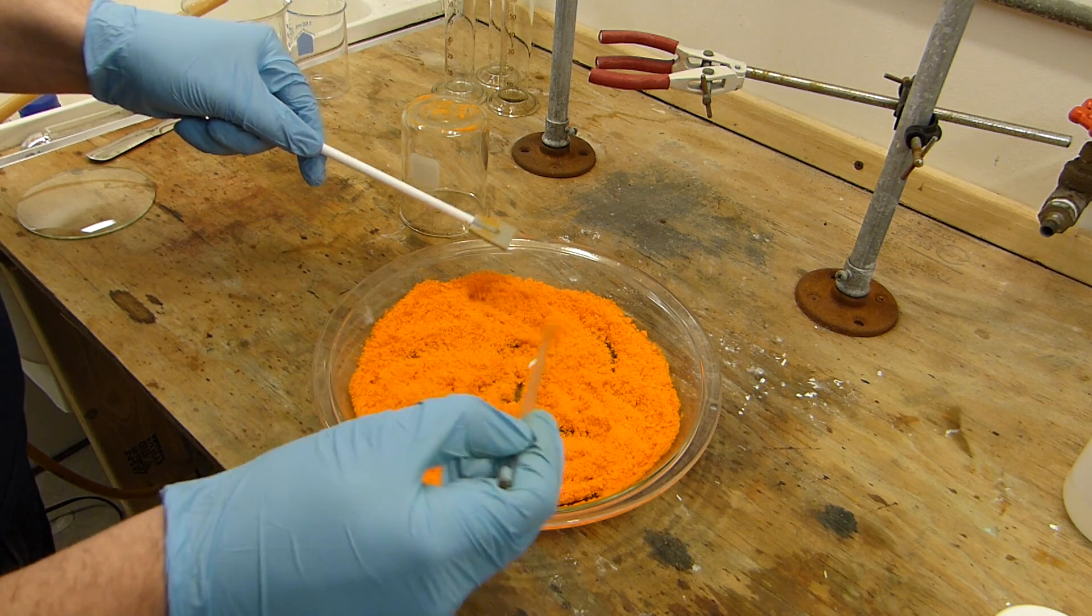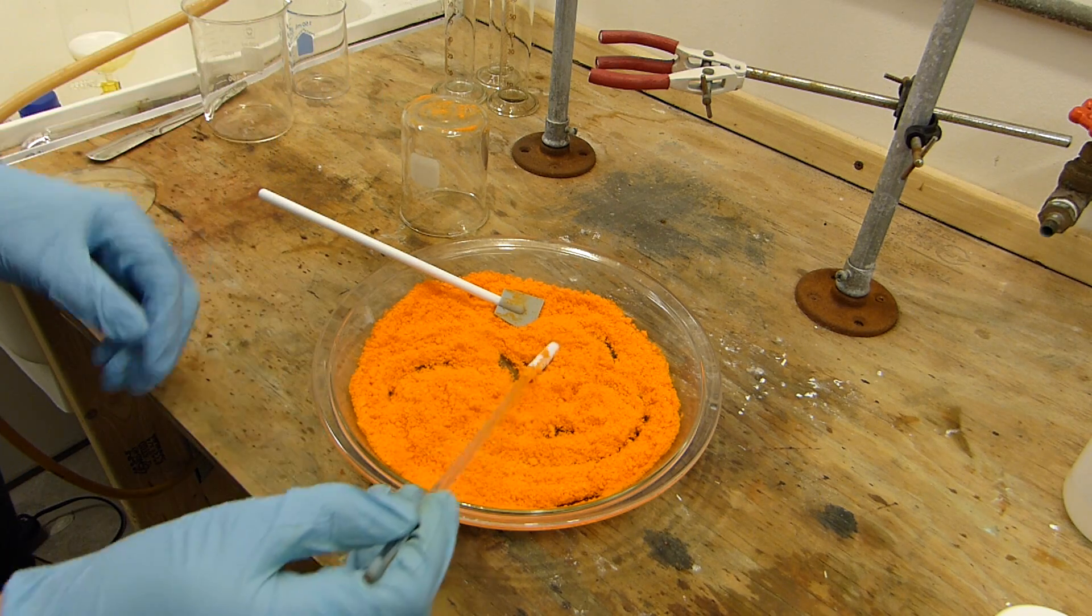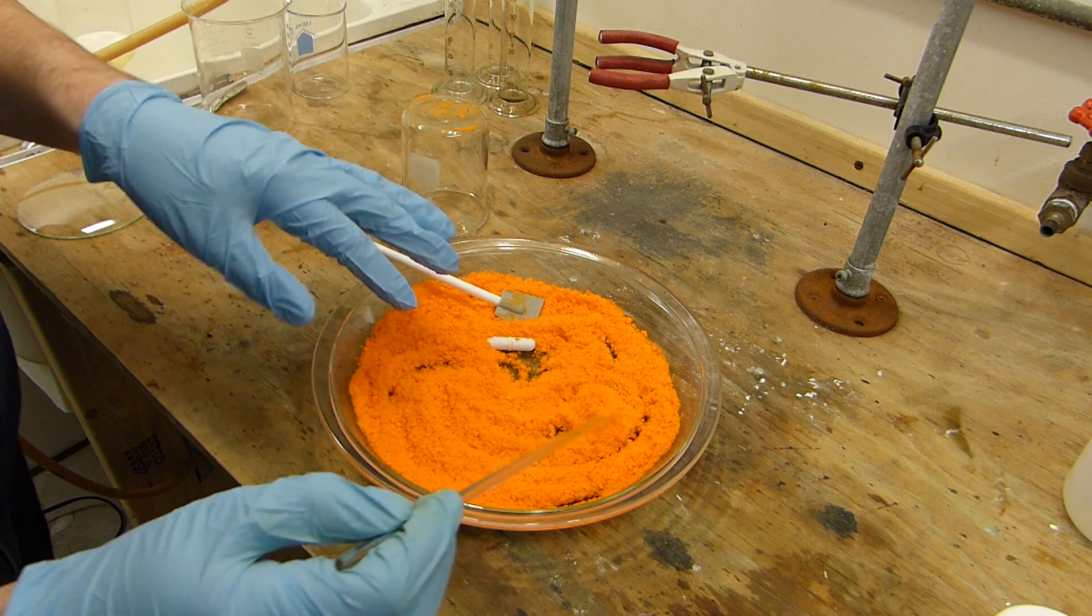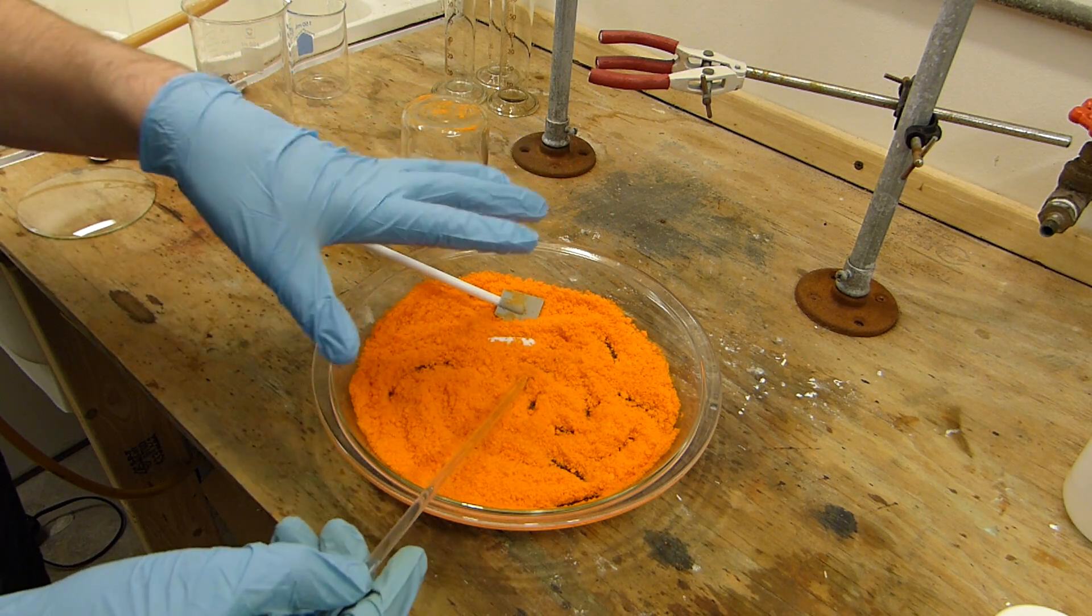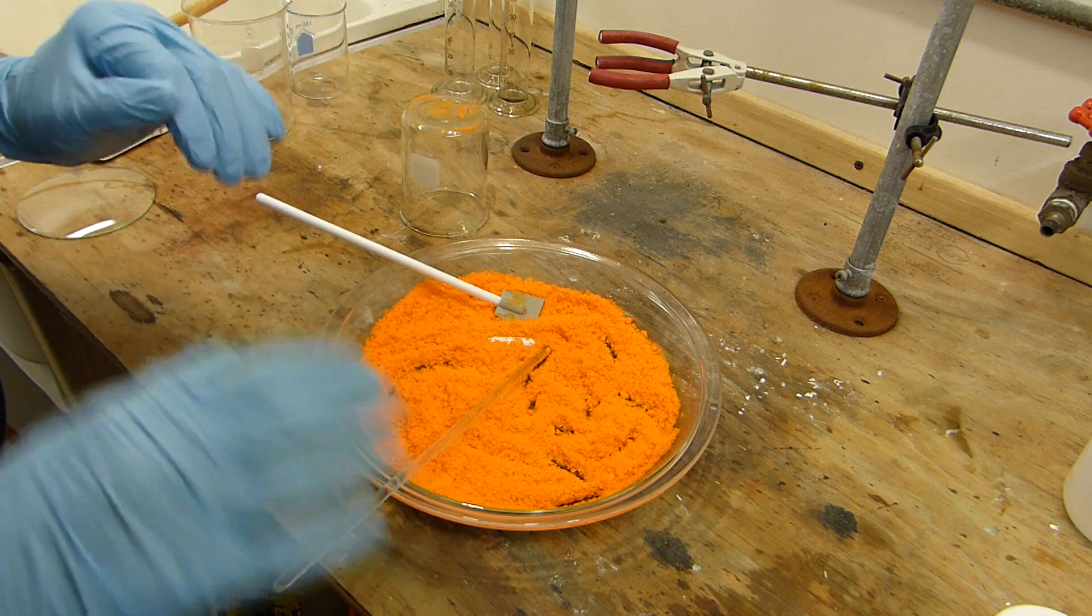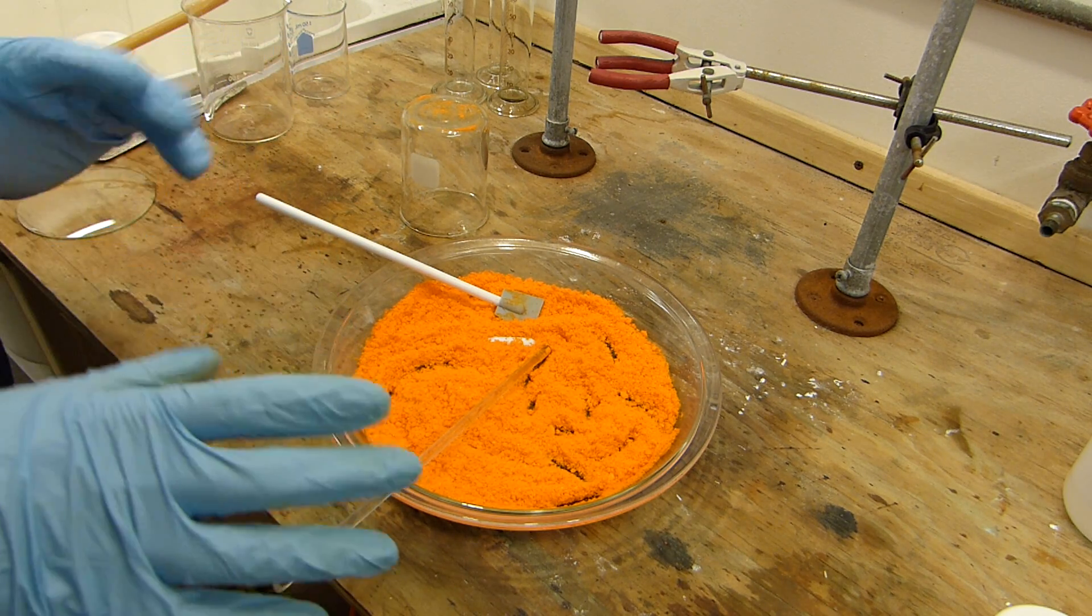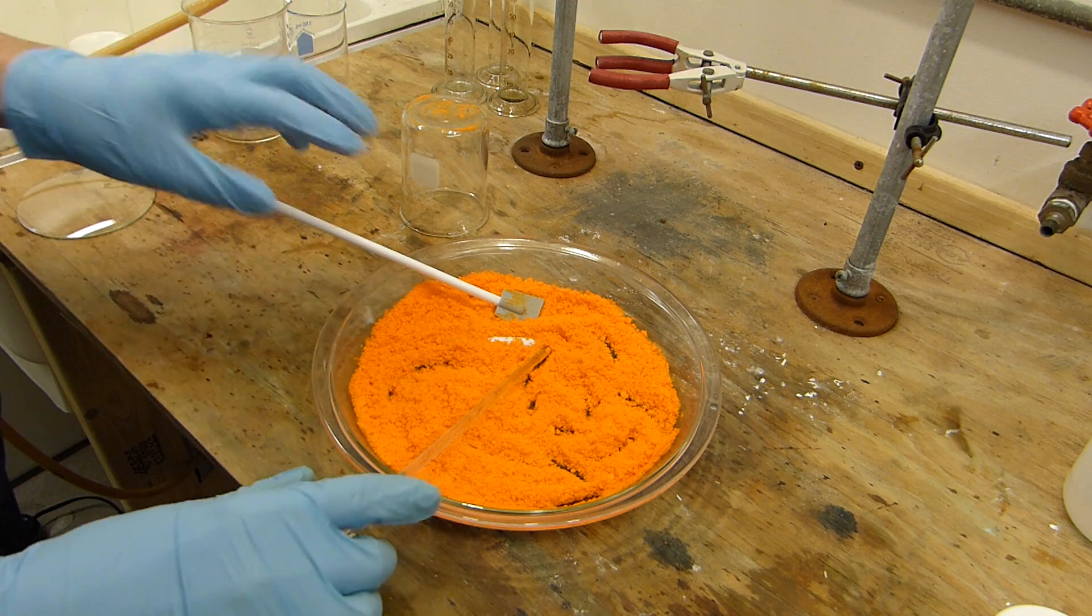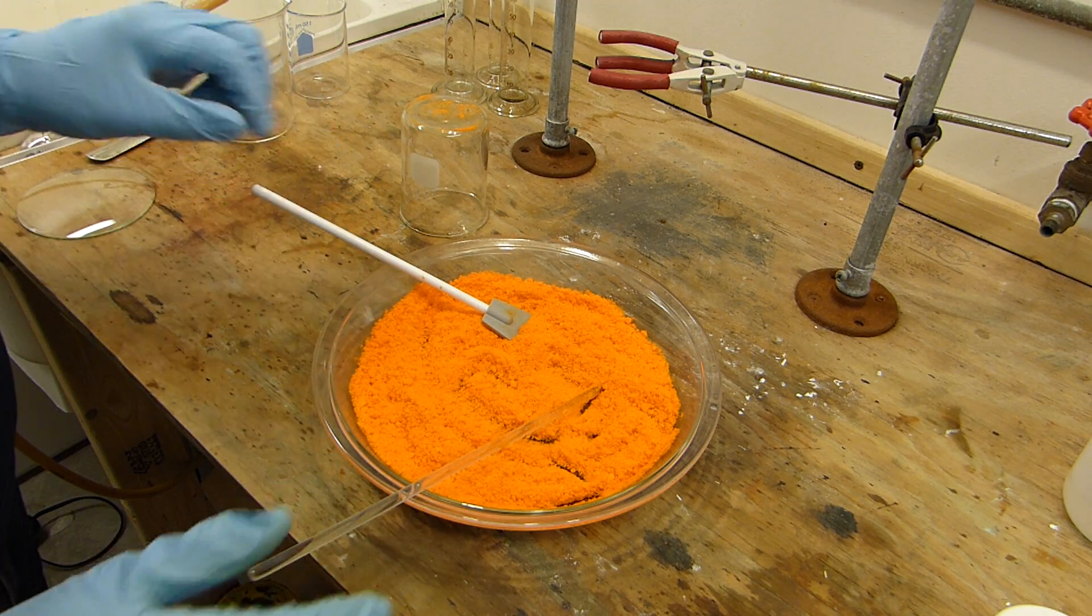All right so here is the dry pyridinium chlorochromate product and I'm just going to put this in a bottle. I initially put this on a water bath but unfortunately it looked like the water bath had begun to melt this. I don't think it was actually melting, I think it was dissolving in the remaining solution that was wetting it, but I didn't want to take any chances with decomposition so I decided to take it off the water bath and leave it overnight instead. So after overnight this is the final product.